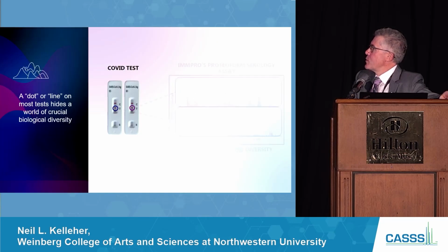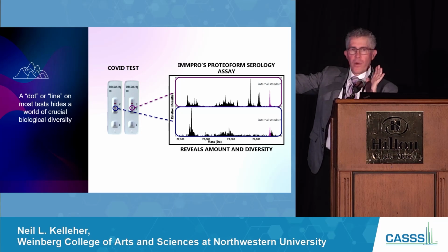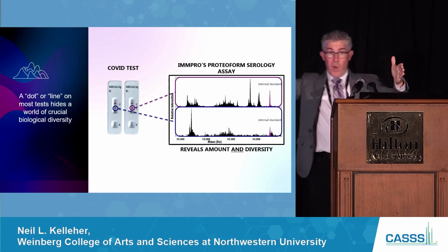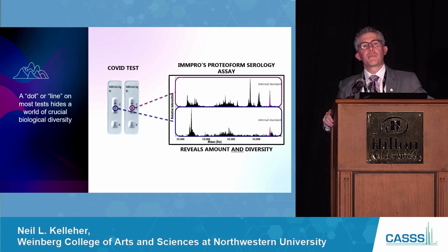But yeah, I'm showing you, look at the space of the mass window there. You have 5, 6 kilodaltons up to 150. There's a lot of range there. So you're right.